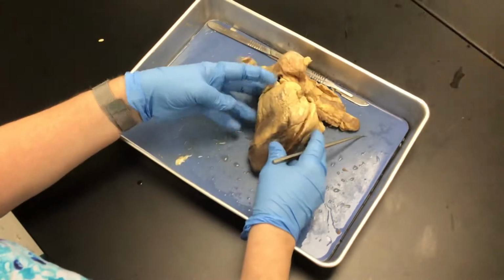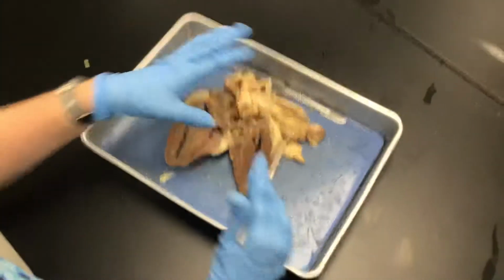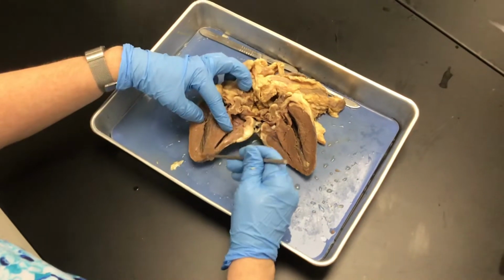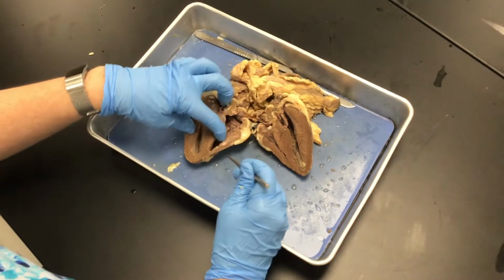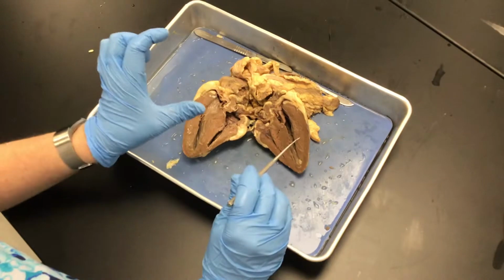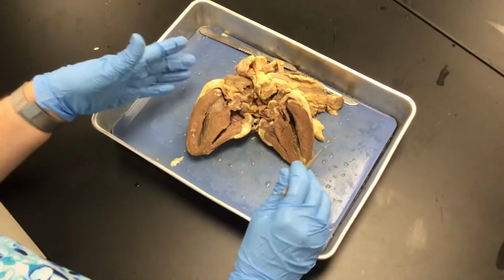Okay, so when you open up a heart, when this is on your test, no matter which half you get, so even if you get this half or just this half, start with the apex, just boom, find the apex of the heart. So we know that the left ventricle goes down into the apex, so this is left ventricle. That makes this the right ventricle. And as I told you in your notes, this is a lot thinner than this. We know the right ventricle only goes to your lungs, and that's about that far. Left ventricle takes it to your body.